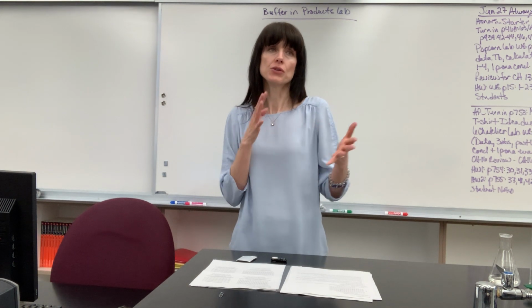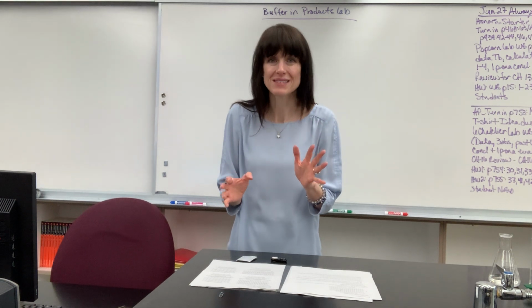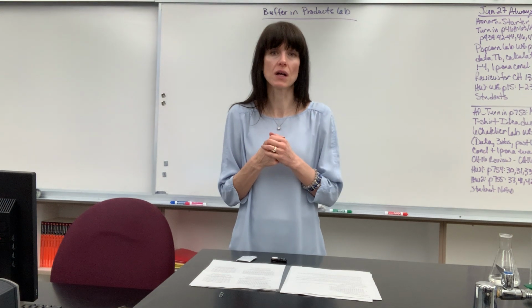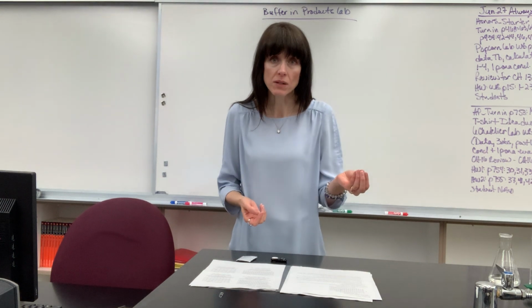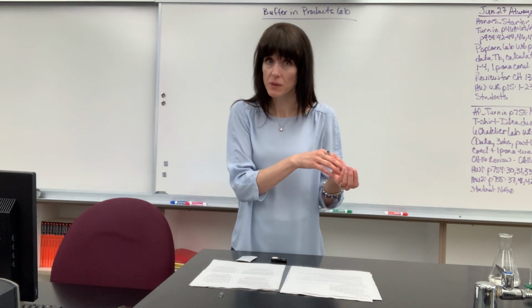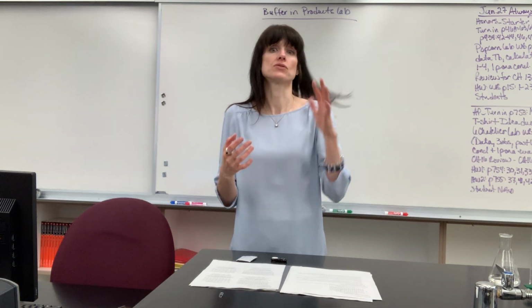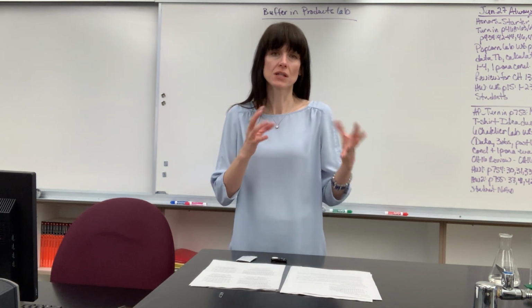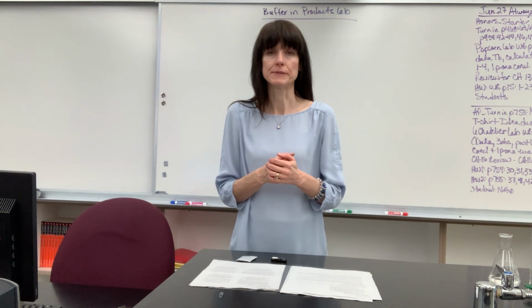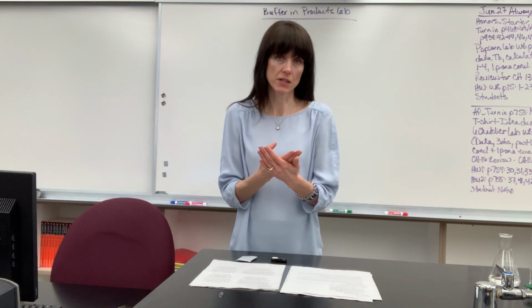Now, if you have a hunch or you look up what's inside of pineapple juice and you think the concentration of citric acid is going to be kind of high, then do 10 mils of the pineapple juice and add distilled water to bring it to 25 mils. That's totally fine to do. You'll still be able to see the buffering ability of that particular substance. So you have to have it in a solution.